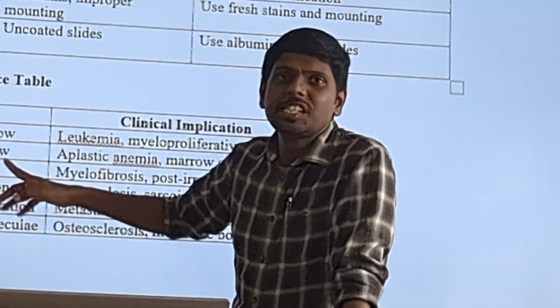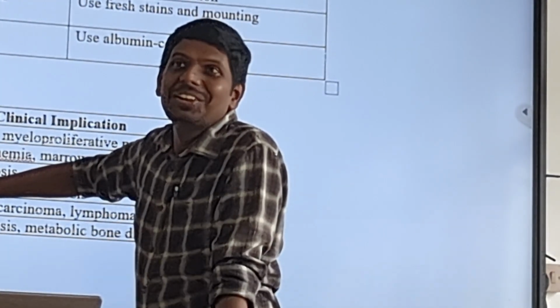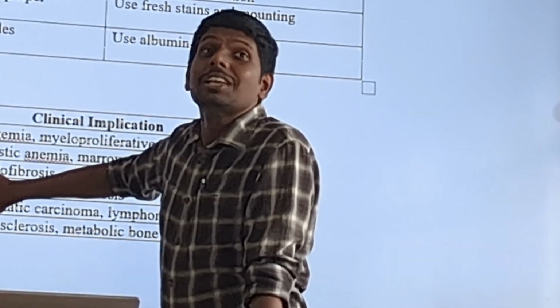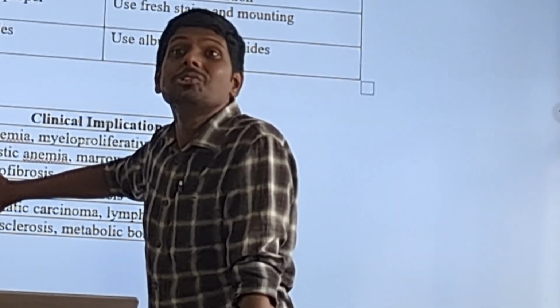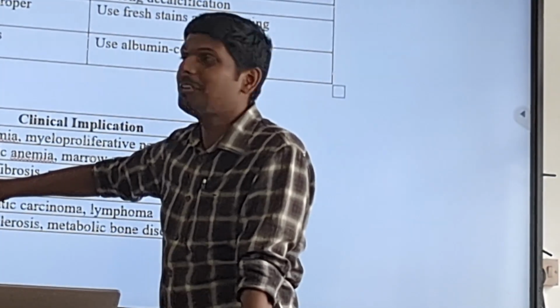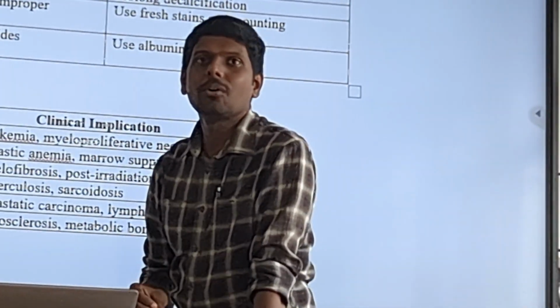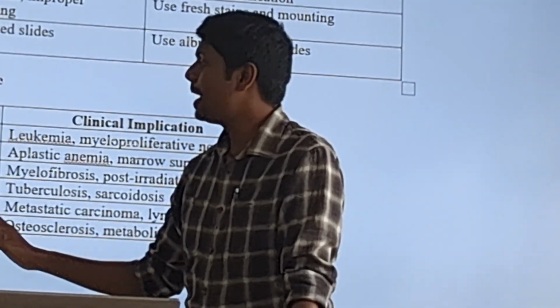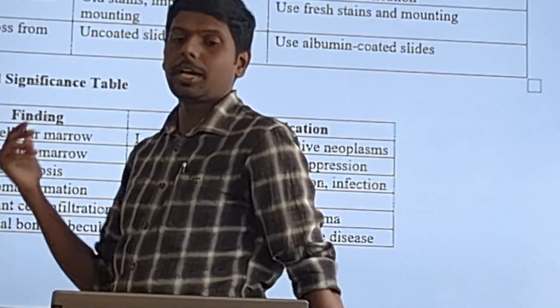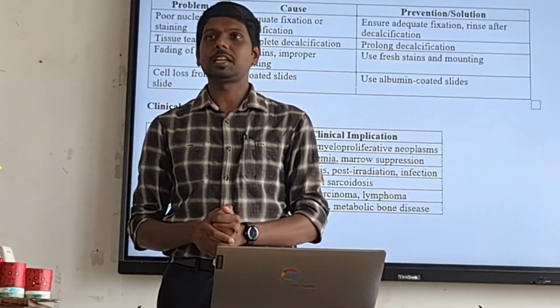Granuloma is particularly seen in what condition? You have already seen, I guess. Do you remember? I said even Egyptian mummies used to have tuberculosis. So tuberculosis we identified because of granuloma formation, nodules in the bone marrow. Okay, granuloma formation. Malignancy and abnormal tubercles or nodules can be detected by biopsy. This is all about bone marrow biopsy and its significance.